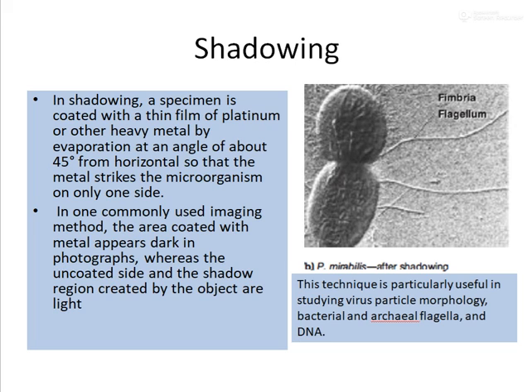So here, since only one side of this specimen is coated with the heavy metal, what happens? That will appear dark in the photographs. So this technique is particularly used in studying virus particle morphology, bacterial and archaeal flagella, as well as DNA. So that's about shadowing.